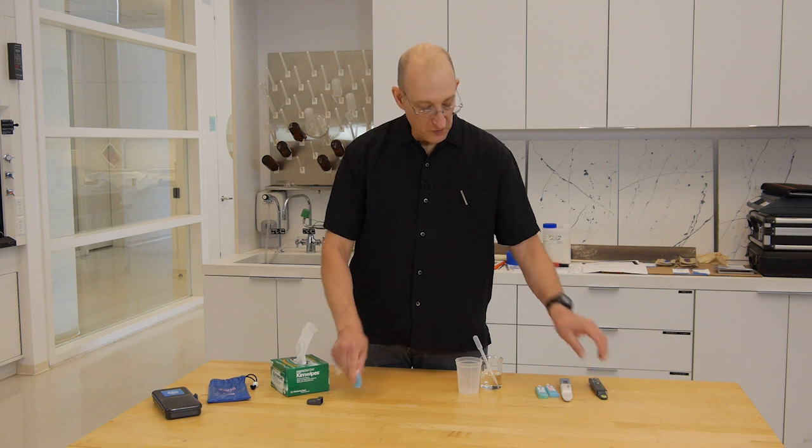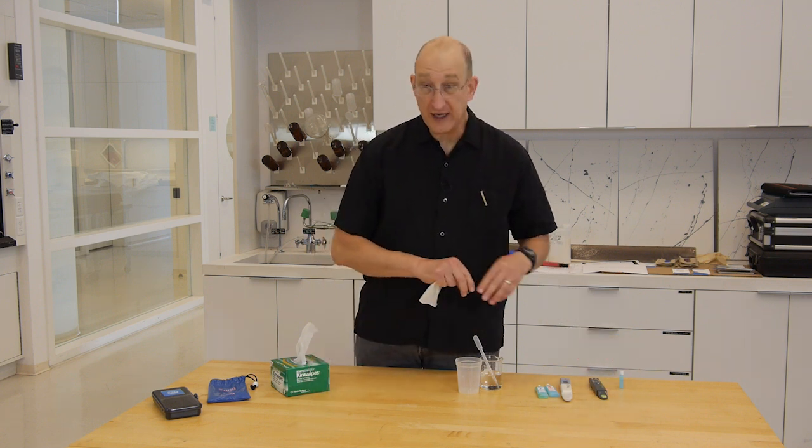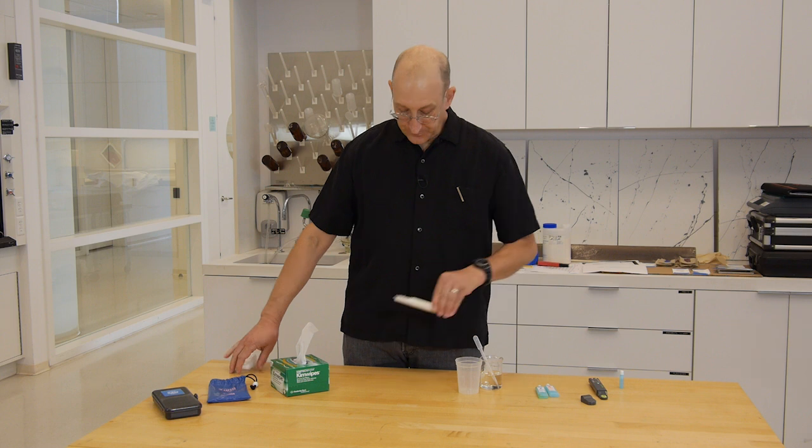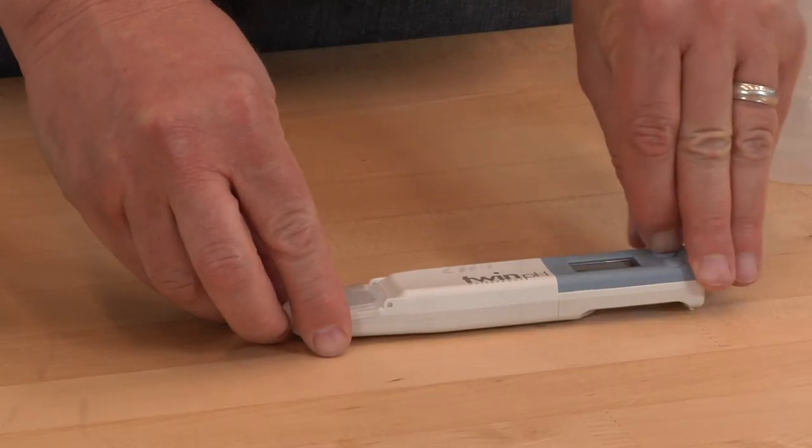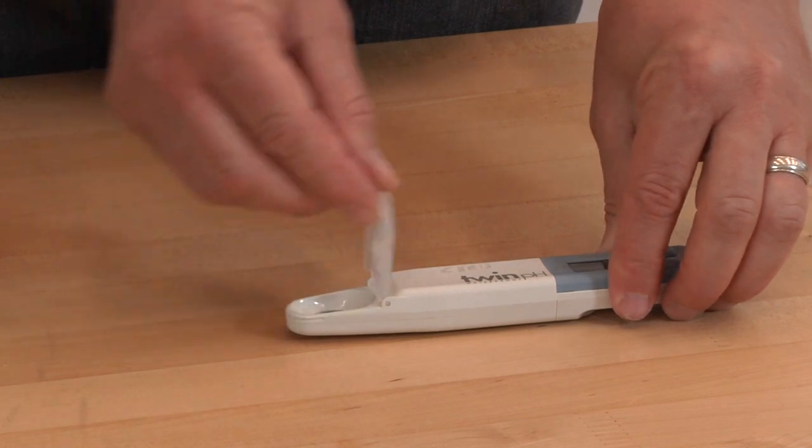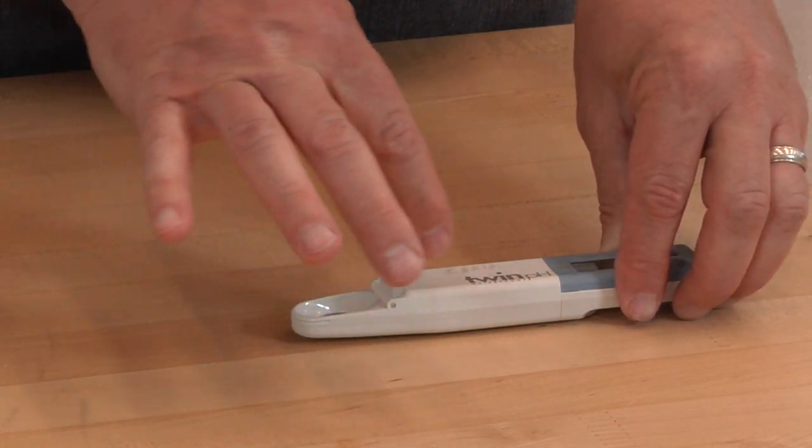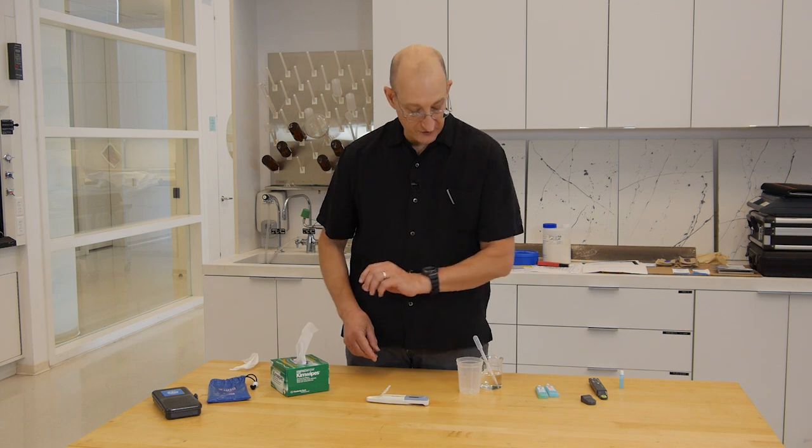For the pH meter, it's more or less the same process, except we're going to calibrate to two points. Again, we turn the meter on and open the sample well. If you prefer, you can take this little flap off. I like to leave it on to protect the electrode.